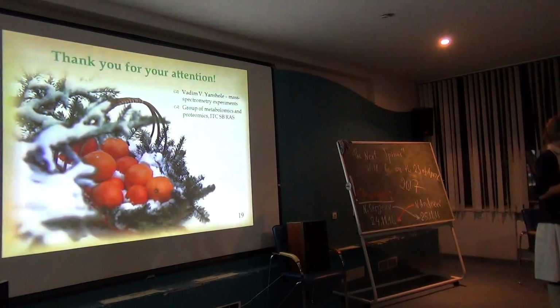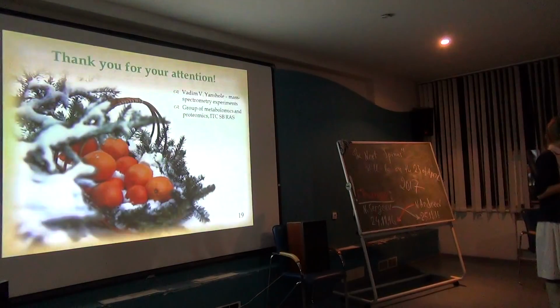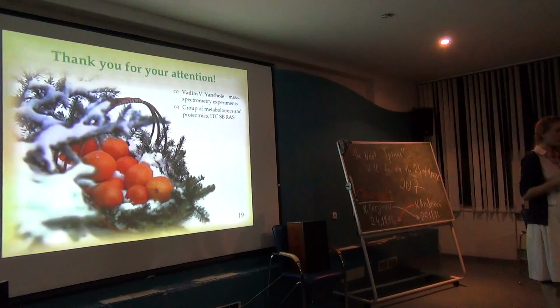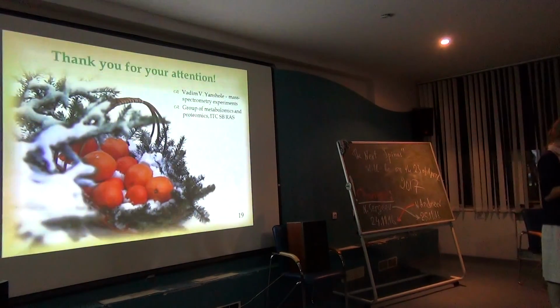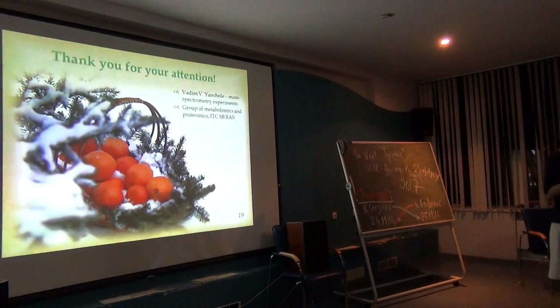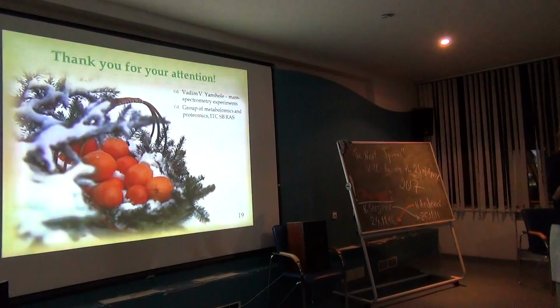As usual, we use many samples for investigation, but we can analyze one group after 2 weeks, another group after 4 weeks. Oh, no. We analyze 4 weeks after 2 weeks: 4 groups after 2 weeks and 4 groups after 4 weeks. So 40 animals every time.